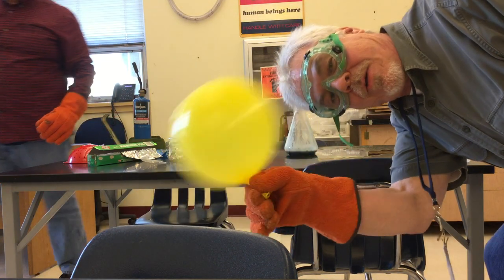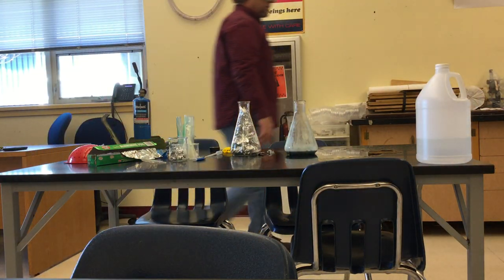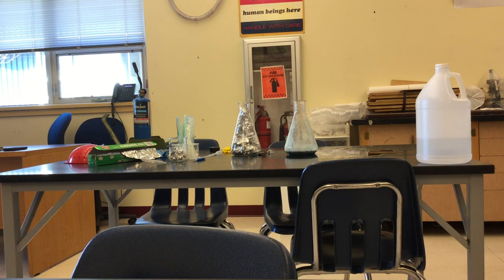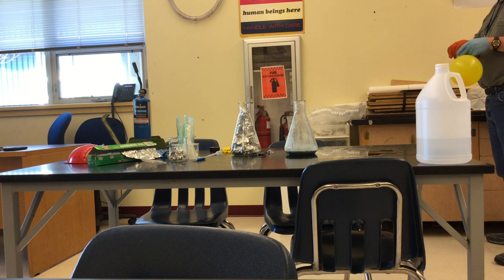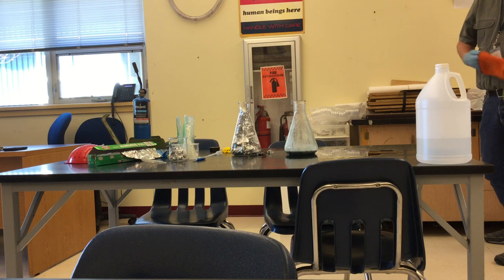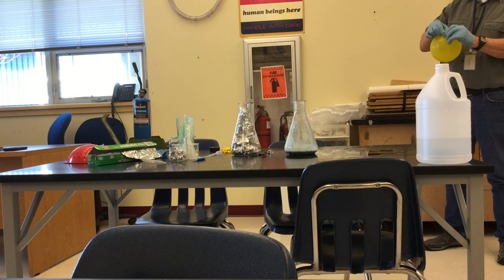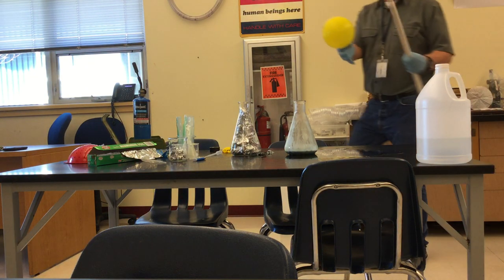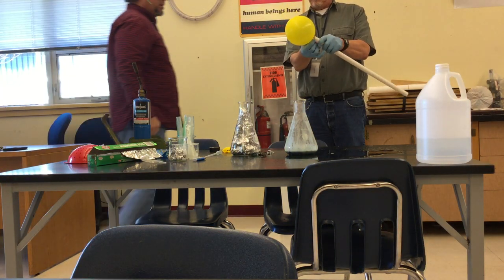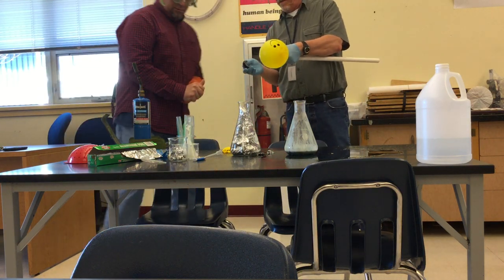I'm going to let it cool down a bit before I take my glove off. So, what do you think we have on the table right there? I got the vinegar — the neutralizer. We have hydrogen in our balloon. Would you do the honors?